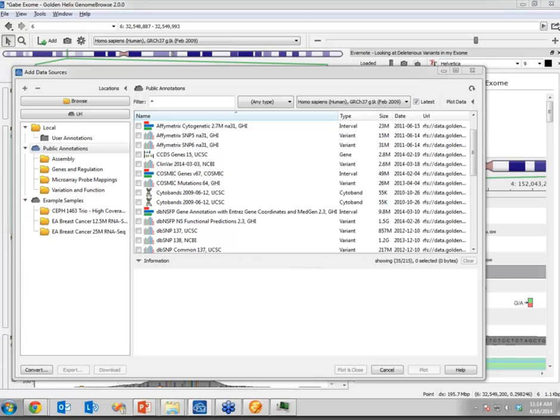Oh, okay. You mentioned BWA-MEM as being good as a first pass. Would you add another aligner for clinical uses? The discordance shown by the Genome in a Bottle data is concerning. Is this issue partly mitigated by the fact that most disease-causing mutations are in more unique sequence segments?